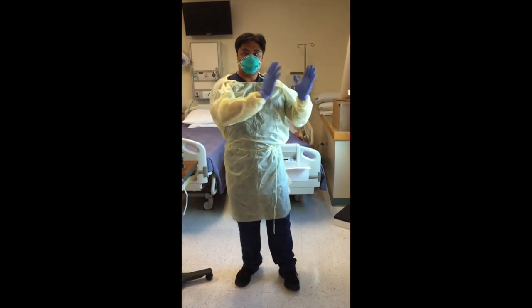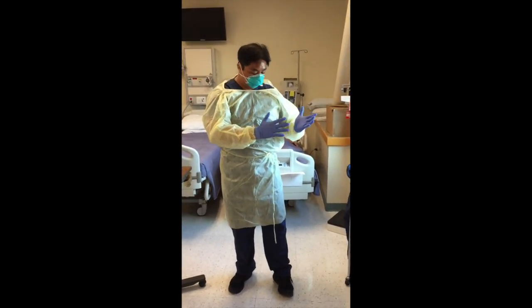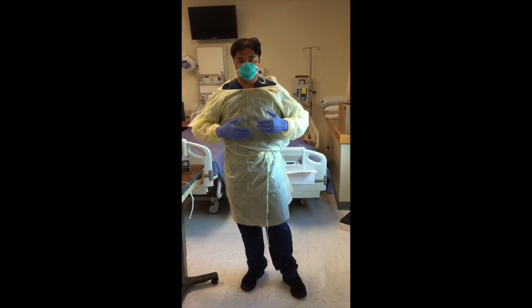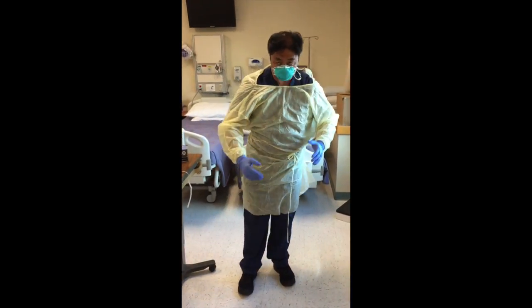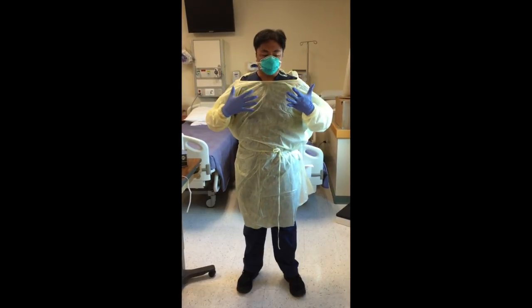Then you would go in and see your patient, do all the procedures that need to be done, and then when you leave, you would start removing all of this. You would start with your shoe covers, take those off, then you would remove your gown.